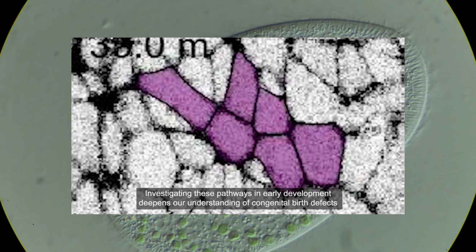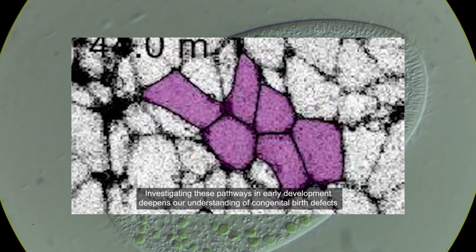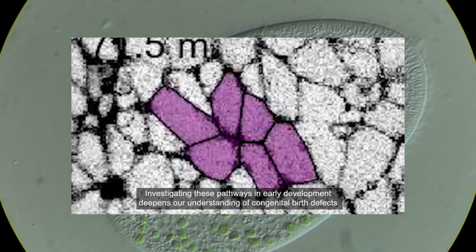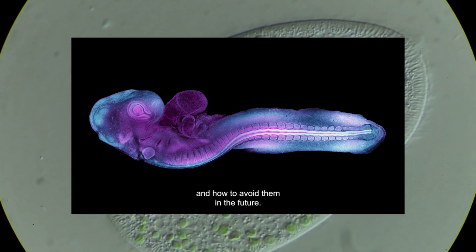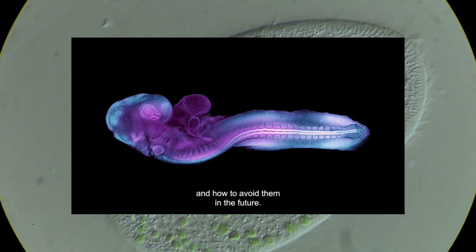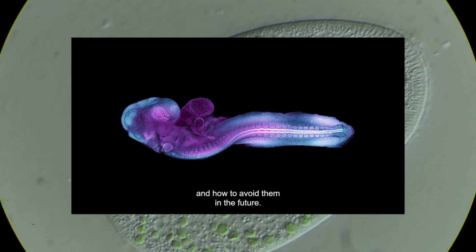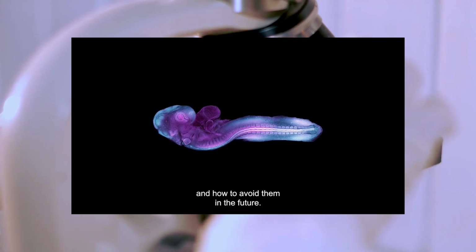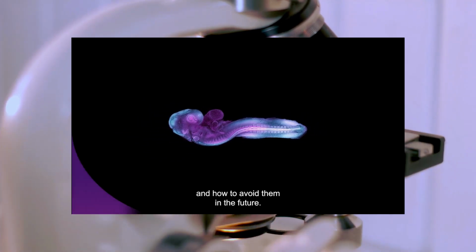This means that the molecules, through the process of excitation to get that emission of light, can cause damage, but the actual fluorescence itself, due to the nature of what it does, can generate reactive chemical products. Oftentimes it's reactive oxygen species, and this means they become even more toxic.